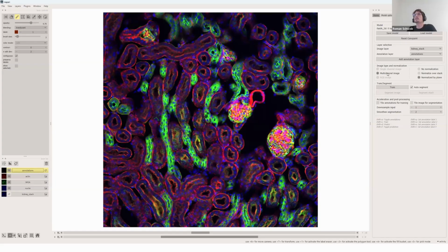And as you can see here, Convpaint realized that it's 4 dimensions. And as I said before, in Convpaint, 4D images are always interpreted as 3 spatial, or like 2 spatial and a time dimension, but basically a 3D image plus a channels dimension. So because it's 4D data, it must be a multi-channel image, and this is inferred by the model. It sees a 4D array and it knows it must be a multi-channel image plus a third dimension, basically.